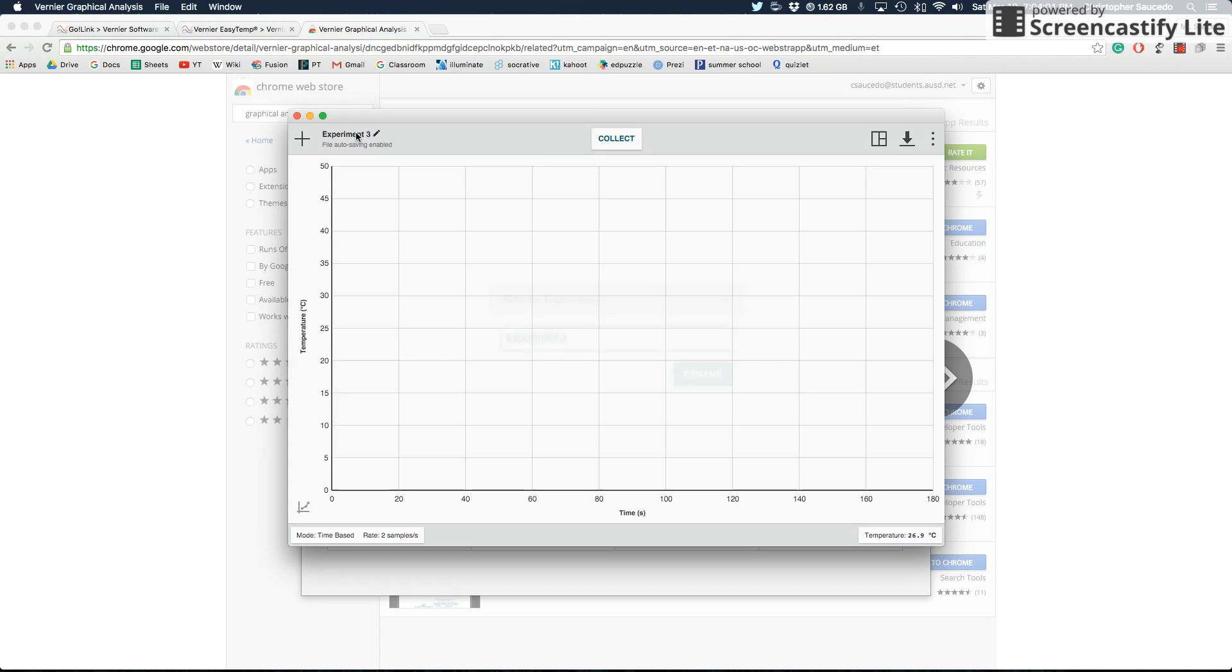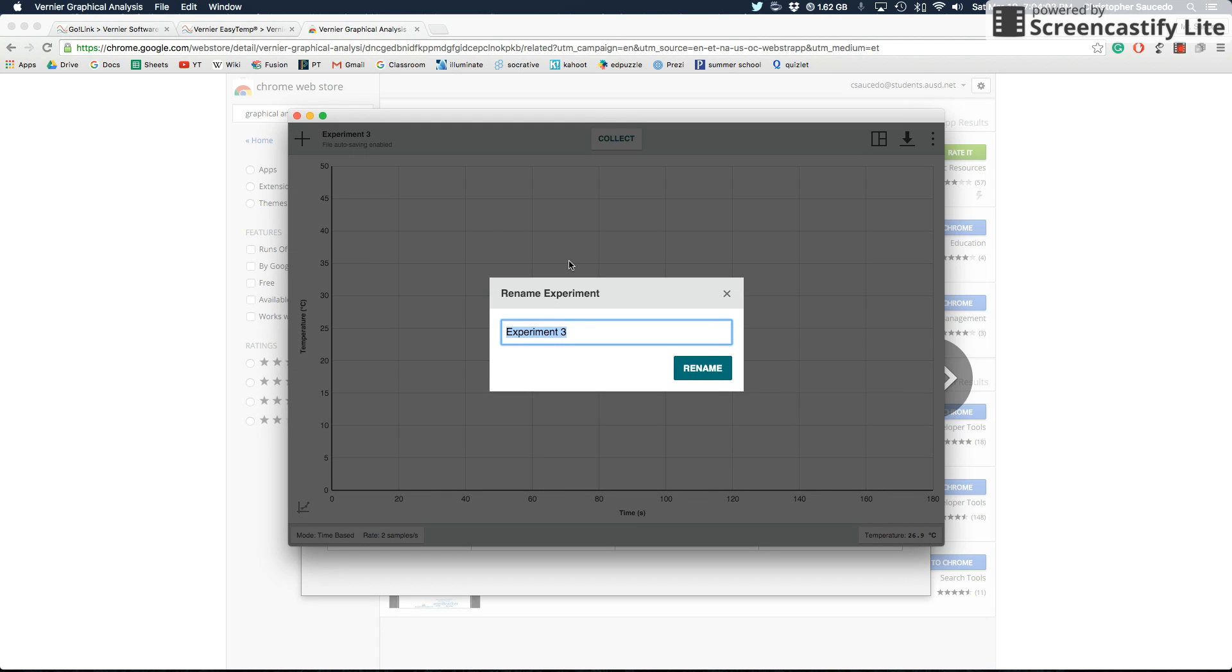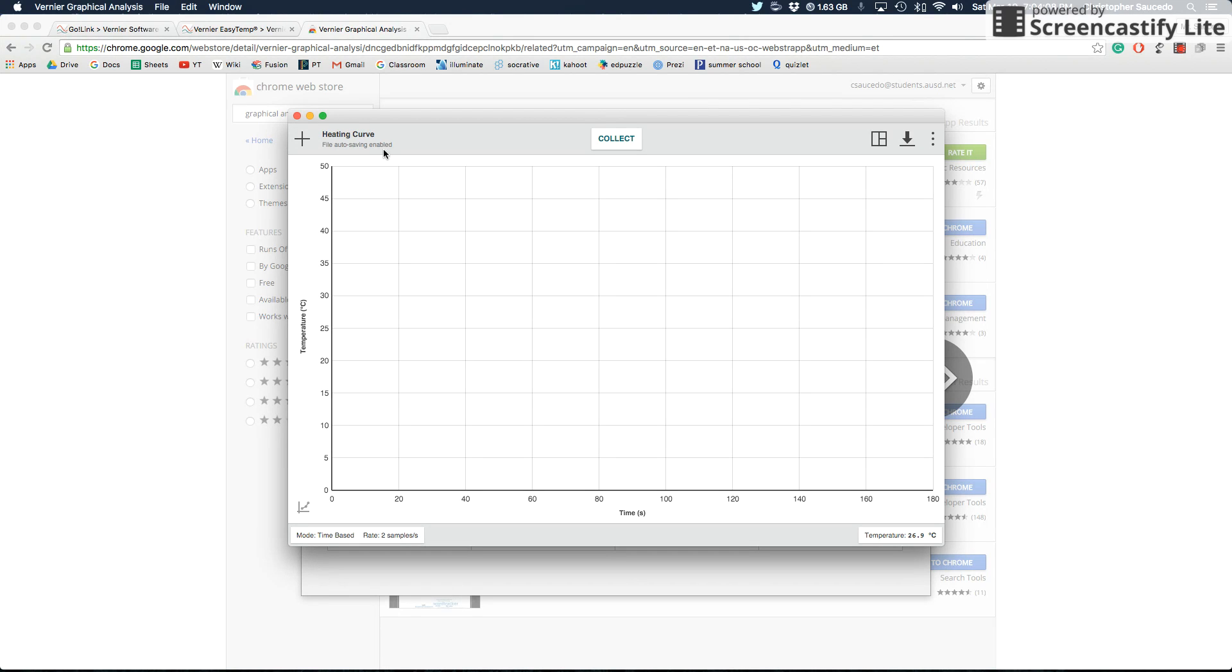Where it says experiment three up here, you can rename that anything. So let's pretend like we're making a heating curve or something. I'll rename this heating curve. And then down here at the bottom, you'll see a couple of different icons.